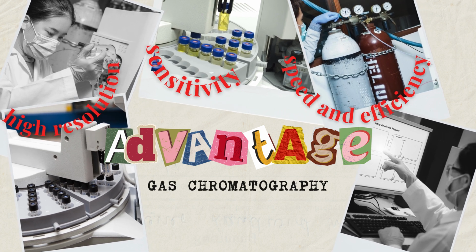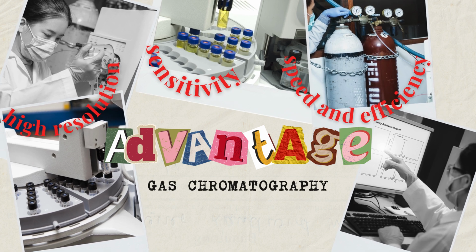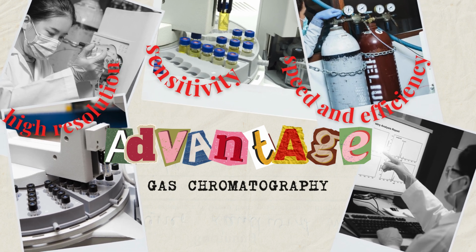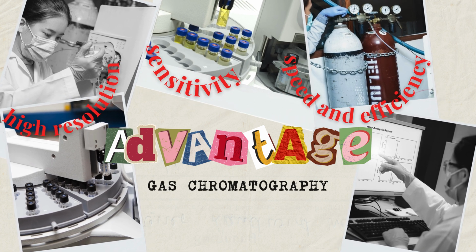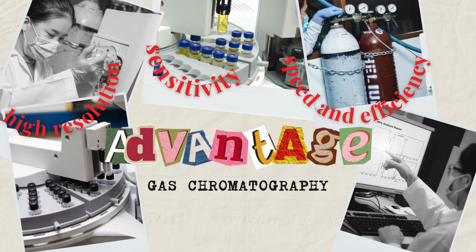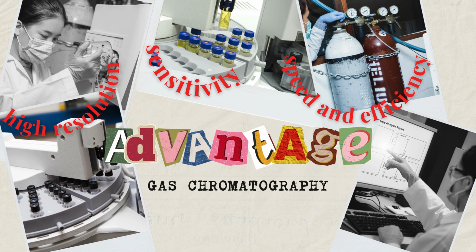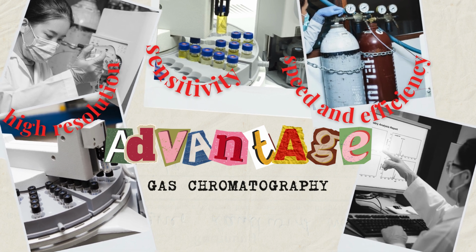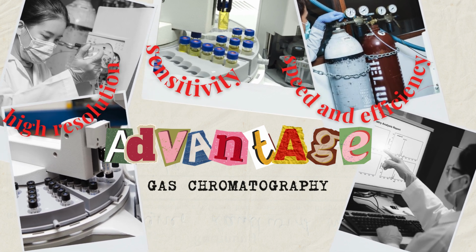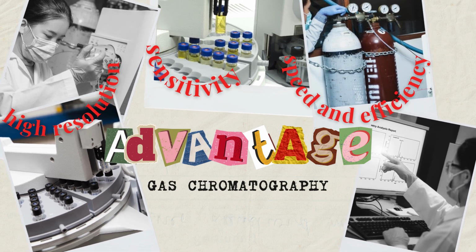Advantages of gas chromatography: high resolution and precision. The high resolution enables accurate analysis of complex mixtures, enabling the accurate detection and quantification of analytes within a sample. Speed and efficiency. Despite its speed, it does not sacrifice the accuracy of outcomes, providing a high degree of precision even in rapid analysis. Sensitivity and versatility. The ability to apply GC to numerous volatile and semi-volatile compounds makes it an indispensable technique in multiple scientific fields.